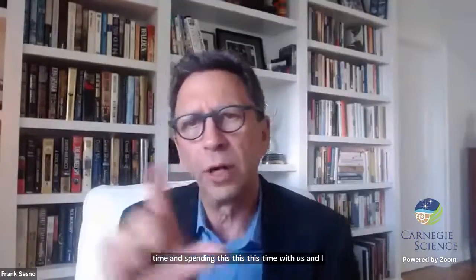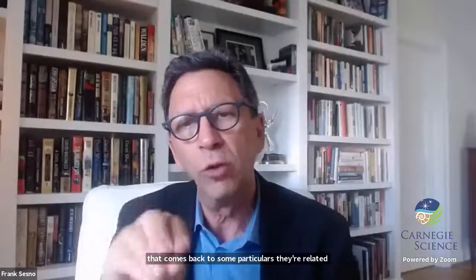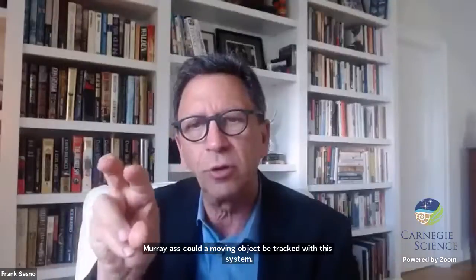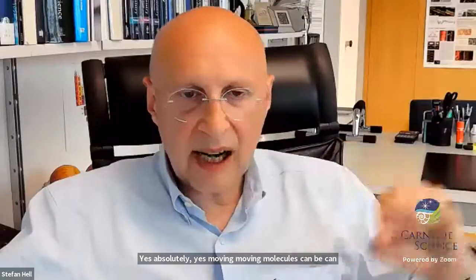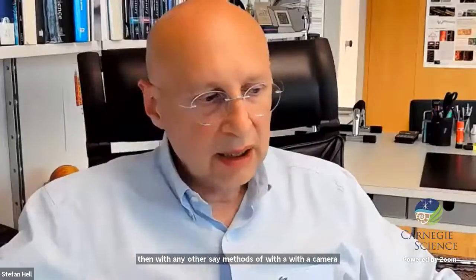And I want to come back to your work and a couple of questions from the audience that relate to some particulars. Murray asks, could a moving object be tracked with this system? And Jiang Wang asks, can frozen biological samples be imaged to capture images of moving proteins? Yes, absolutely. Moving molecules can be tracked with higher precision and at higher speed than with any other method. With a camera, that has been the normal way of doing that. Can frozen objects be seen? Yes, that's correct.